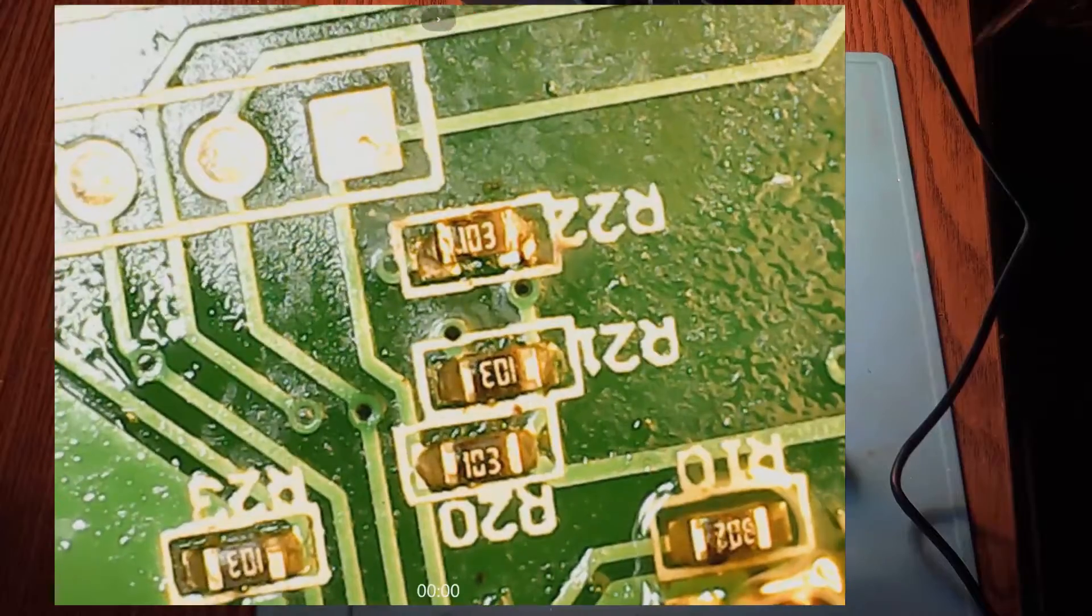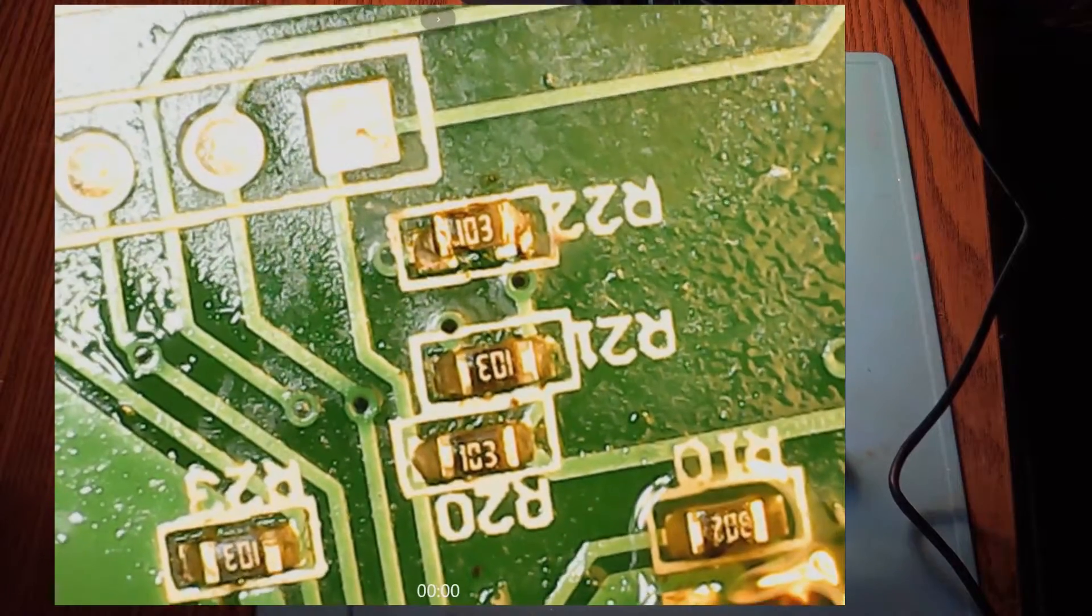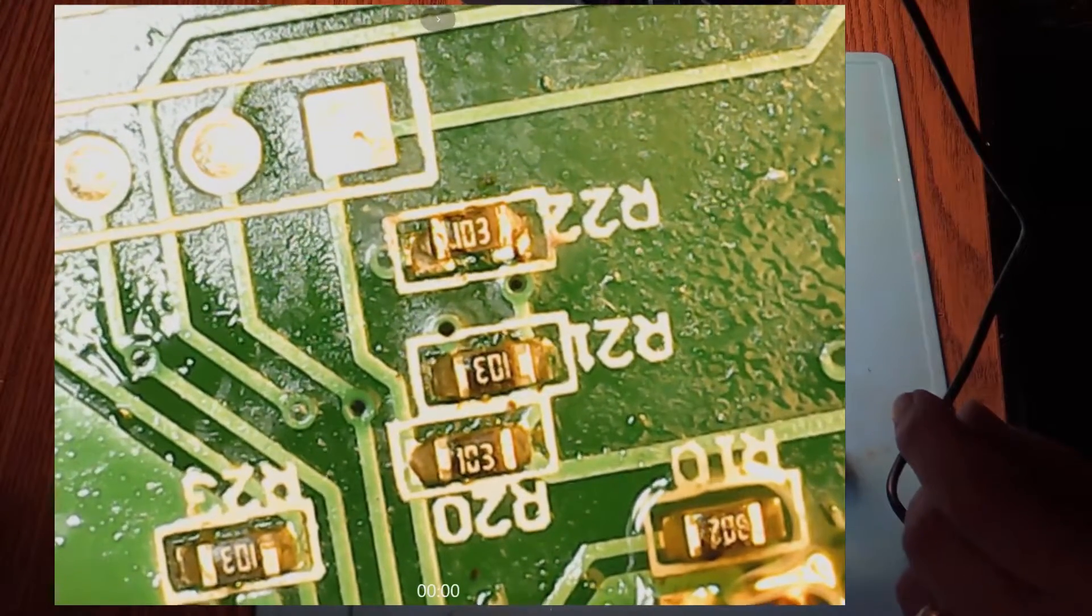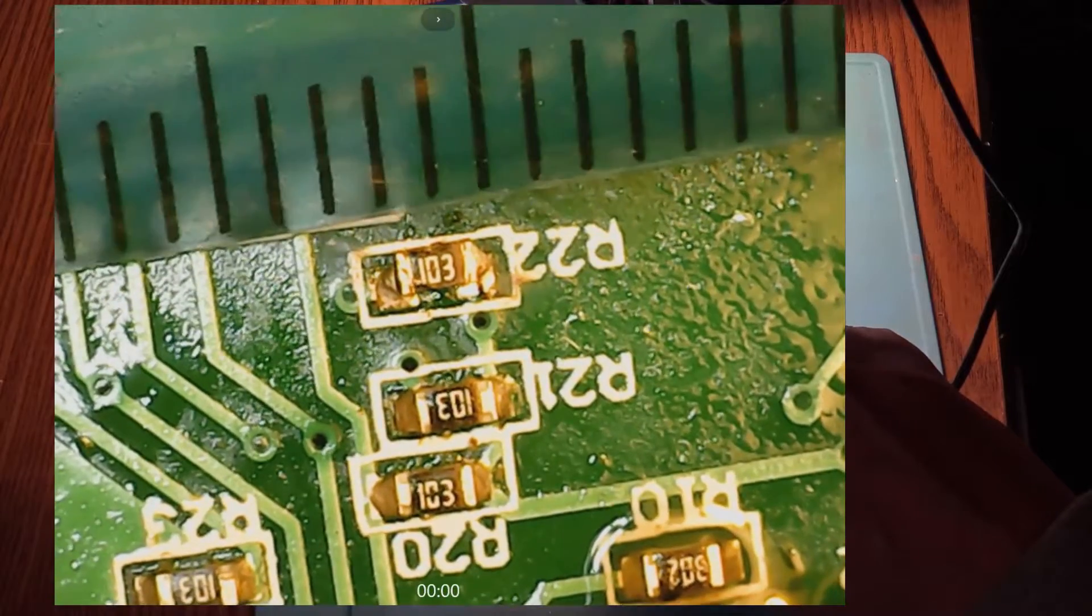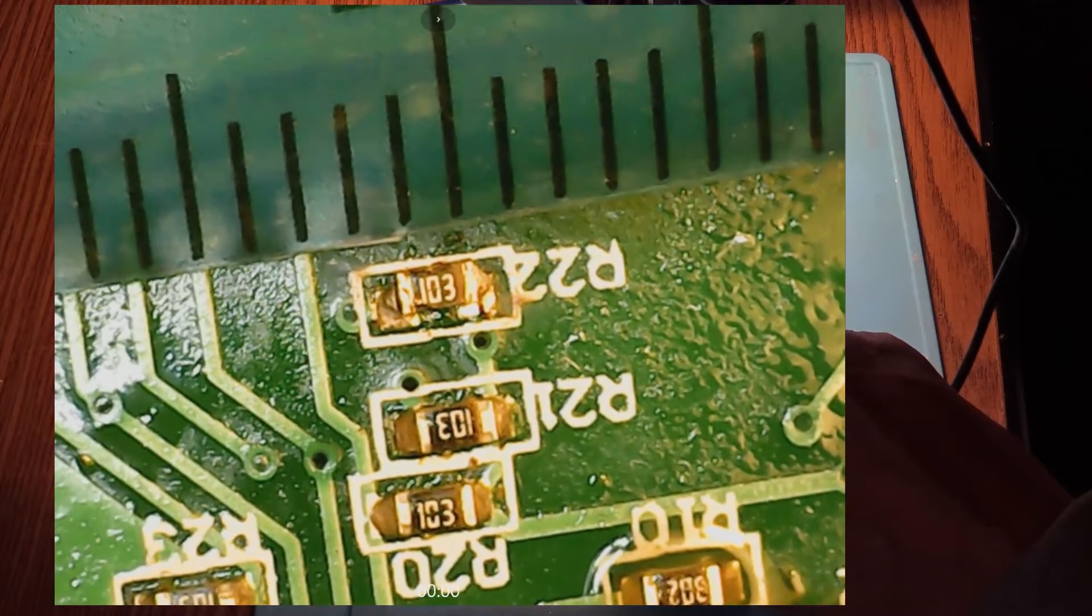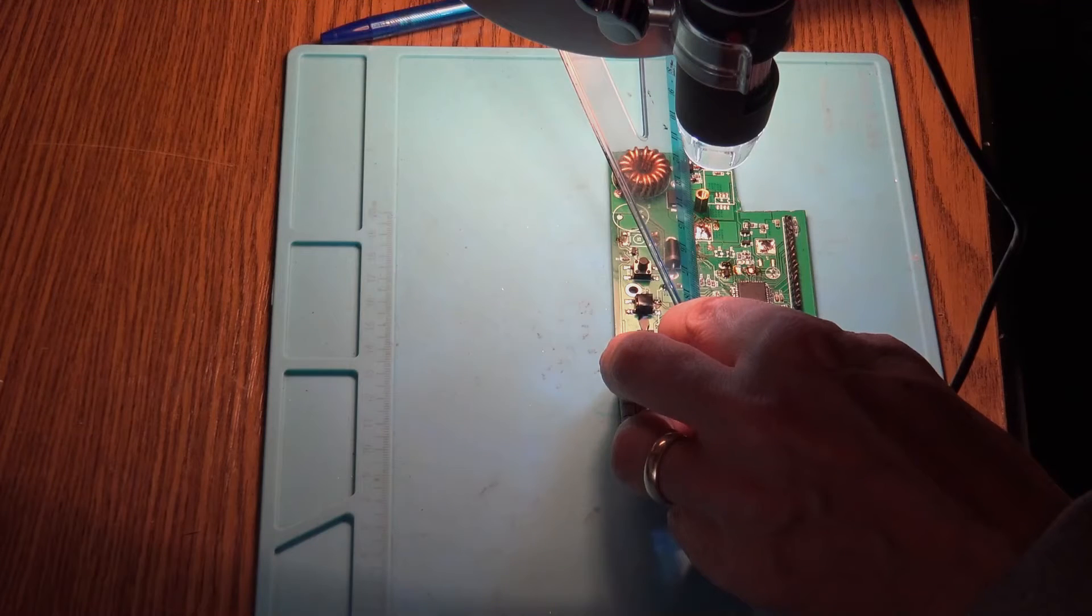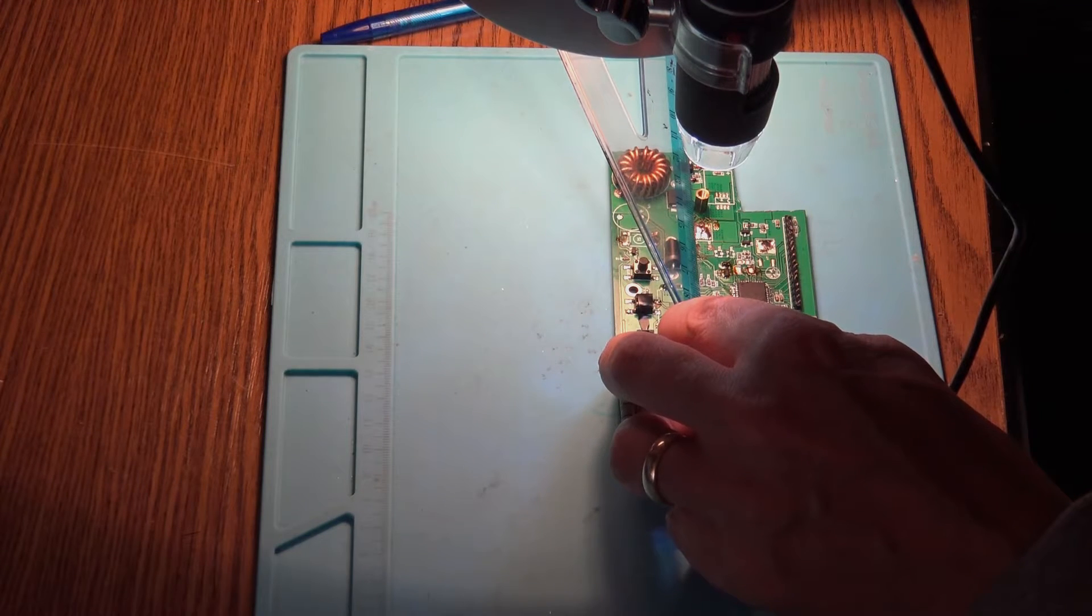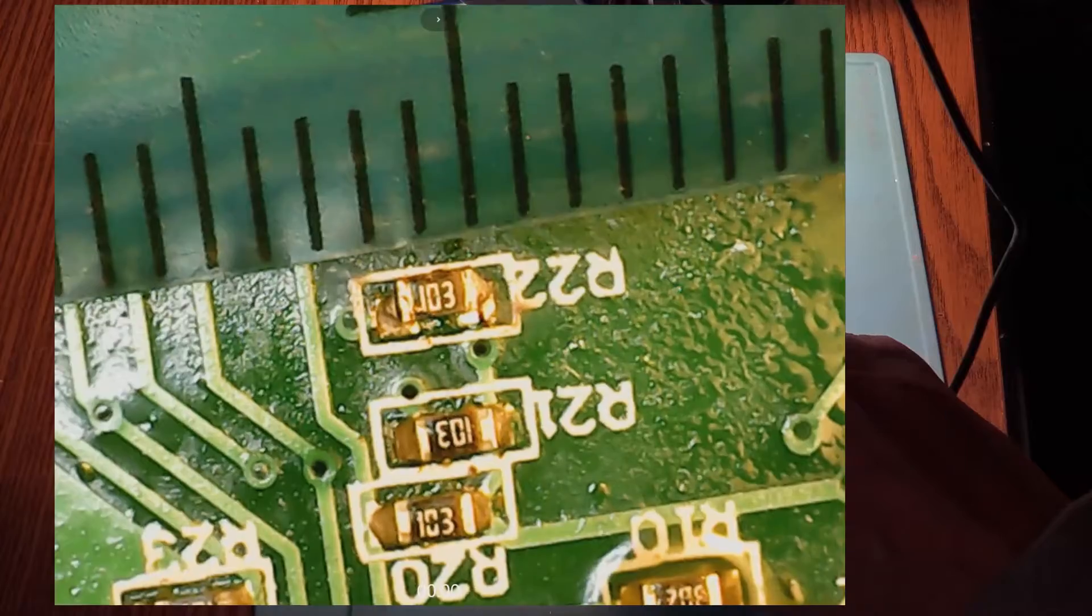You can't believe how tiny are these little parts. Let me show you. So we have a ruler here. That should be one millimeter, one point one or something. From there to there, one millimeter and a half. These are really tiny. These are millimeters, guys.